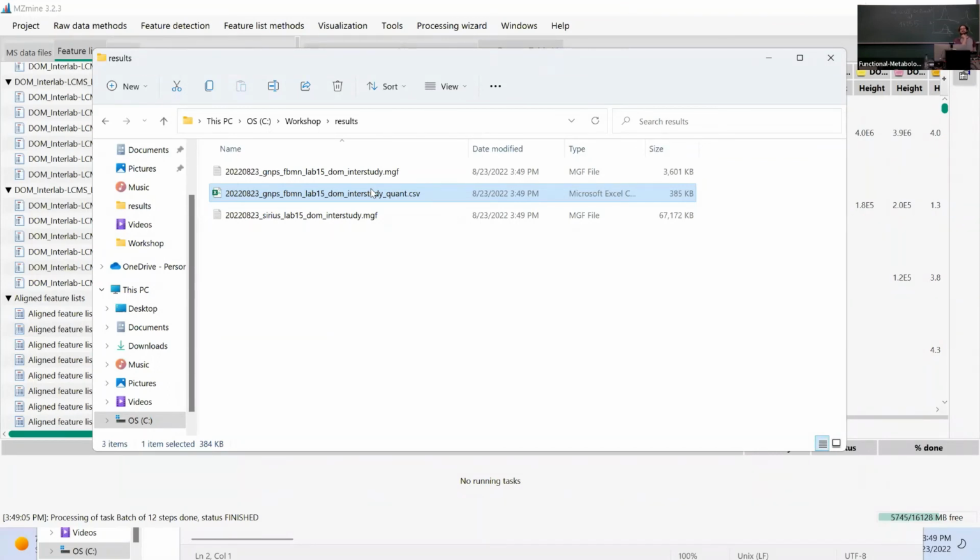Oh, it didn't. No, but I stick with my data, and then make more people maybe do a file and then all what you did. But no, that's the exporting step. Can we just look at the parameters?